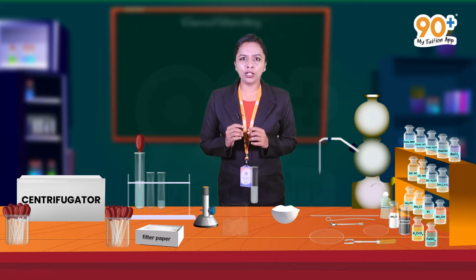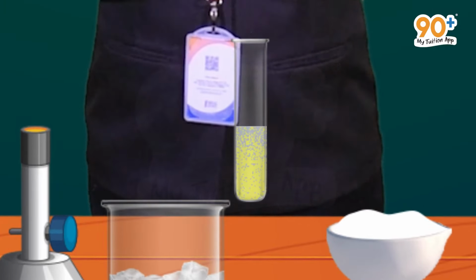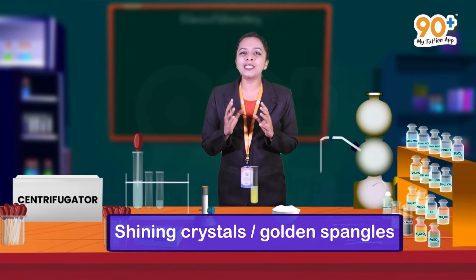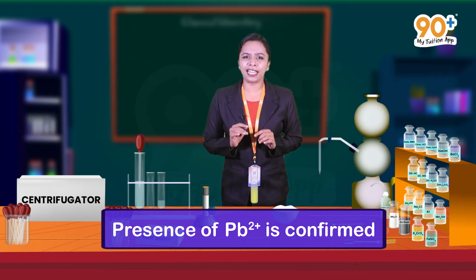Now cool this solution. Do you observe anything here? Yes, it reappears as shining crystals or golden spangles. So it confirms the presence of lead ion.